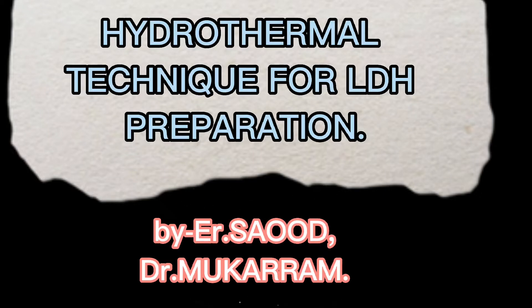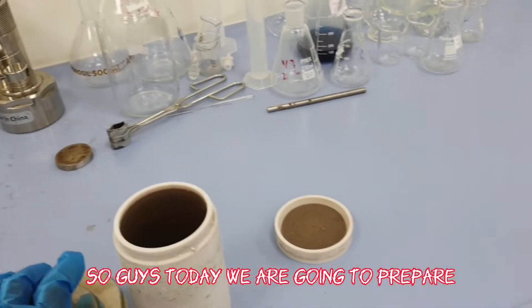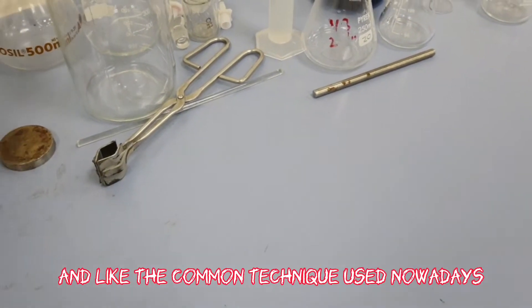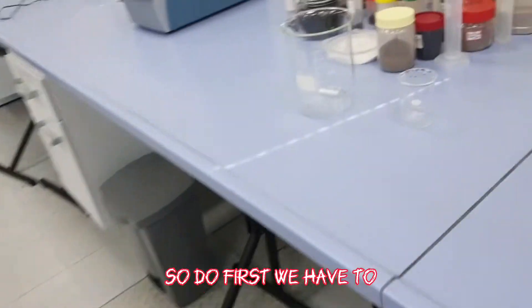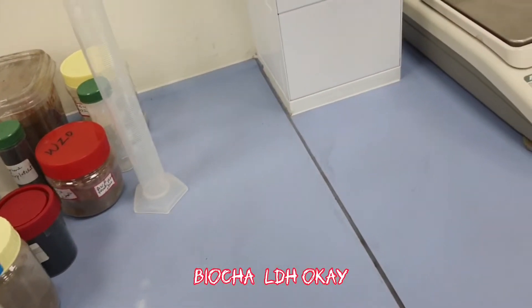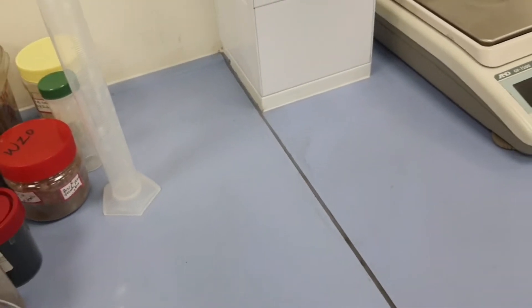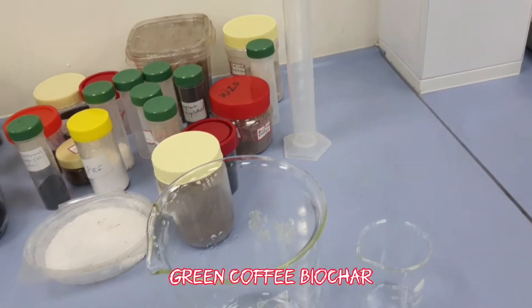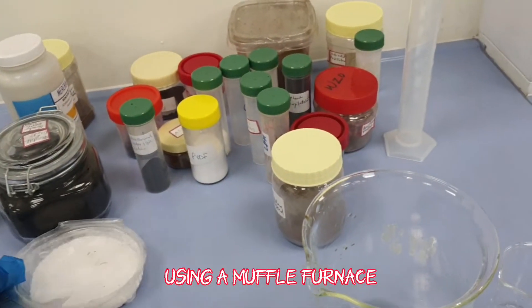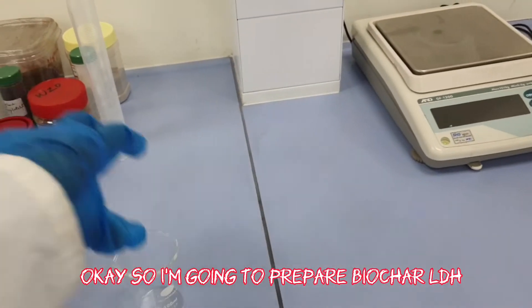Today we are going to prepare LDH using hydrothermal technique, which is one of the most common techniques used nowadays. We are preparing biochar LDH — specifically using green coffee biochar, which has been prepared by pyrolyzing using a muffle furnace at 600°C for one hour.